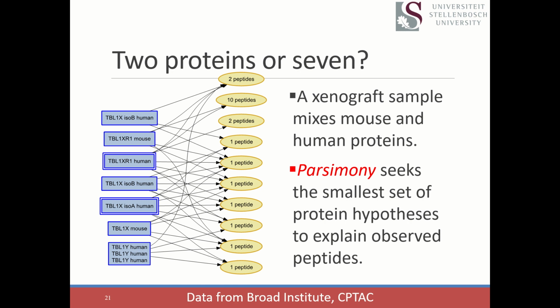In the bad old days of the 1990s, you could get away with claiming that all of those proteins were there. But today, reviewer 1, 2, and 3 will all mess you up for it. So, how do we protect you from that? We need a concept of parsimony. We need to have some way of grouping identical proteins to say these proteins, any one of them, would be an equally good explanation for why we saw these peptides. That's a case of indistinguishable proteins.